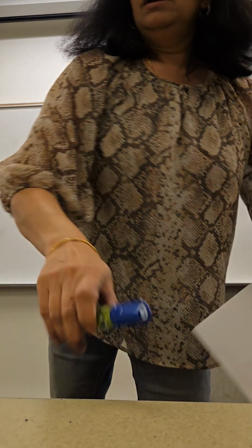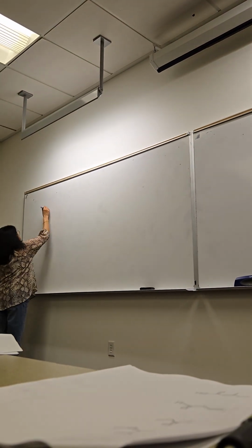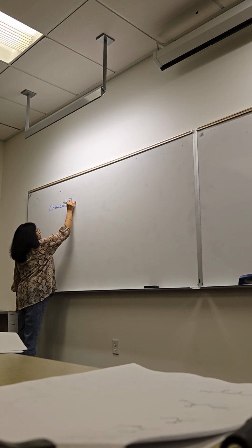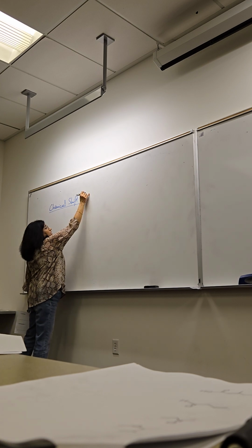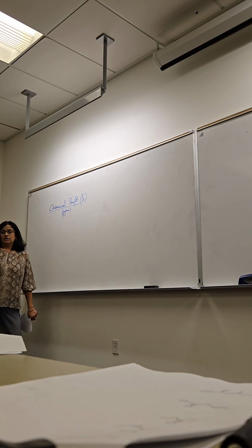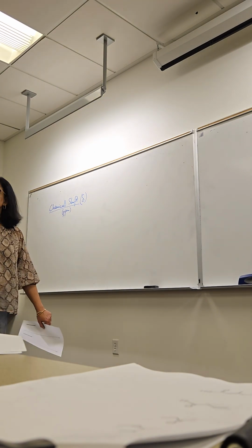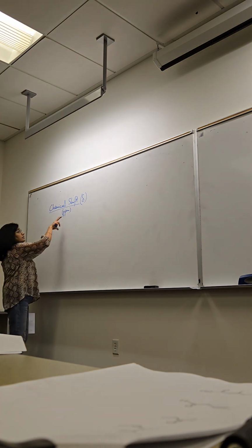So let's look at how an NMR spectrum is set up. We saw IR yesterday. Let's look at the setup of an NMR spectrum. And that is chemical shift. Chemical shift has a symbol, delta, lowercase delta. Its units are ppm, parts per million. There's a formula which we are not going to go over that uses the megahertz magnetic field strength and converts it into ppm.